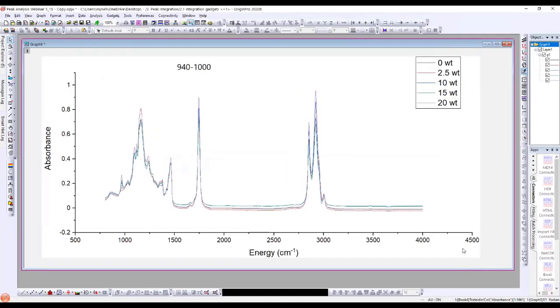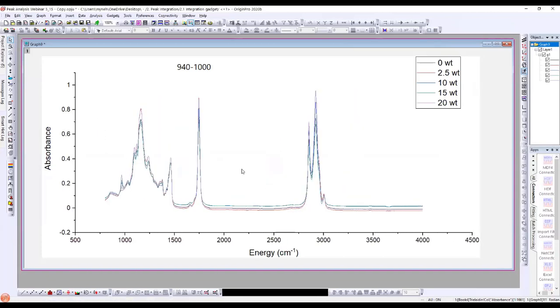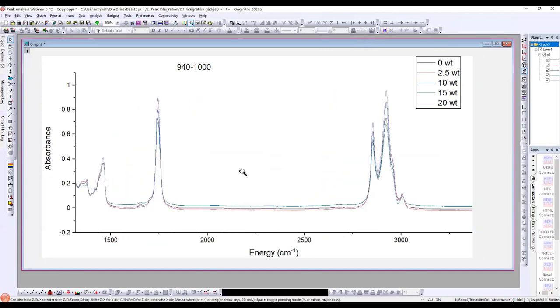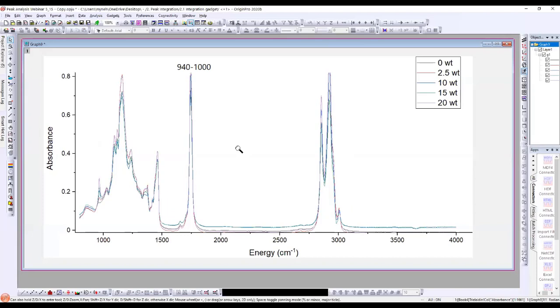And the spectrum is now in full span. If we want to scan the spectrum, we can simply press the X key on the keyboard and use the mouse scroll to move left and right along the spectrum, and you can press Shift and X to move it up and down. You can use the Z key to enlarge horizontally, and Shift and Z to enlarge vertically.